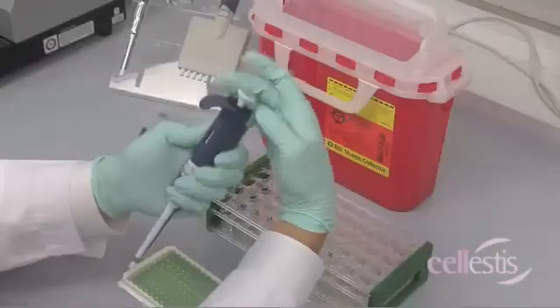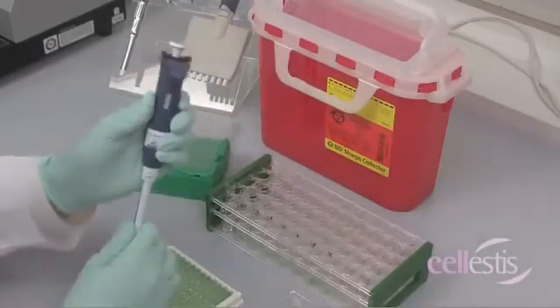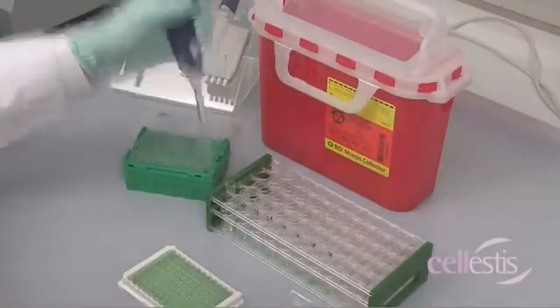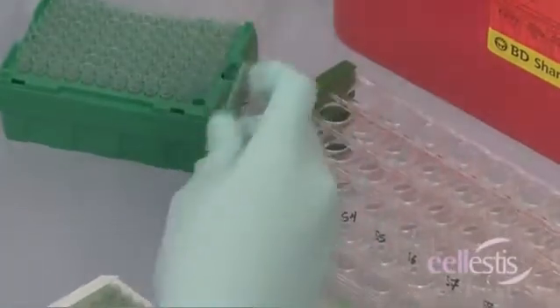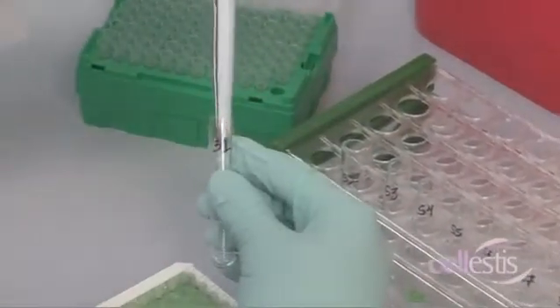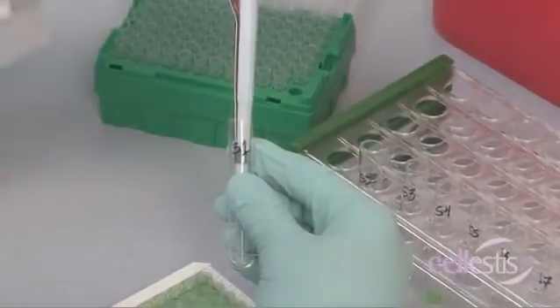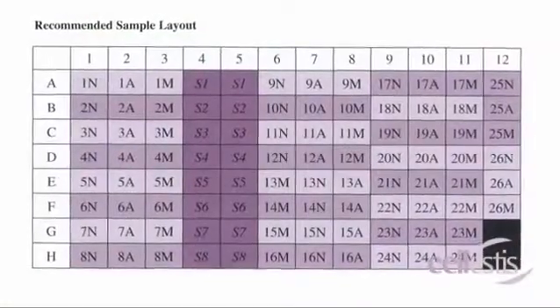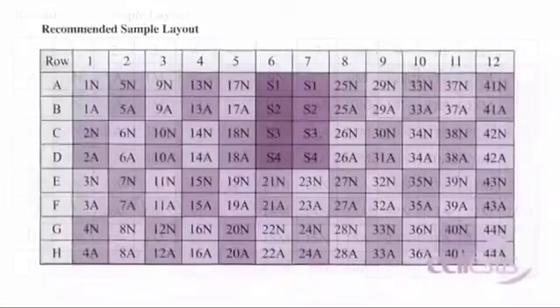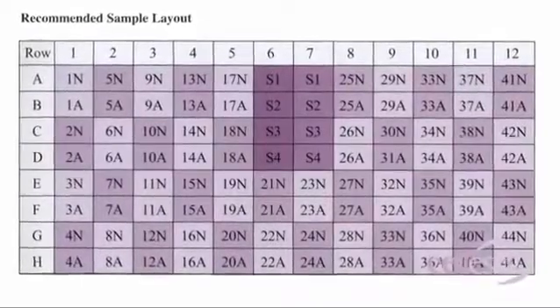Finally, add 50 microliters of each standard S1 to S8 when using the 8-point curve, or S1 to S4 when using the 4-point curve, to the relevant ELISA plate wells, keeping in mind that each standard must be run at least in duplicate.